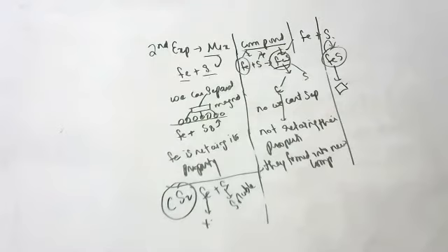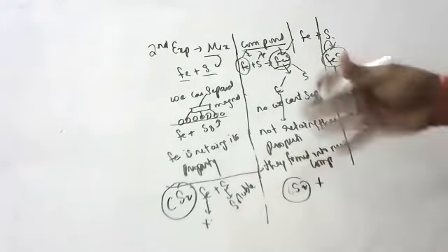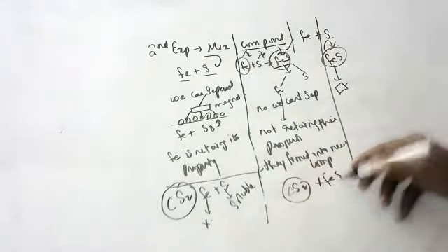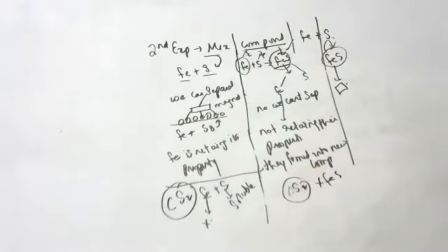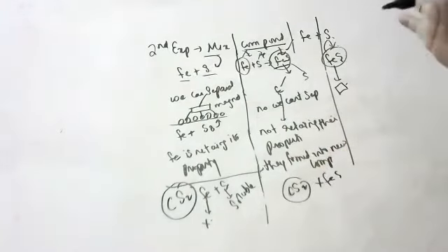This is number one, children. Number two: here, in carbon disulphide, iron sulphide has no effect. I will mix iron sulphide in carbon disulphide to see whether it is soluble or not. They won't react. They won't mix in carbon disulphide. If you take iron sulphide and mix it in carbon disulphide solvent, they won't even react, children.